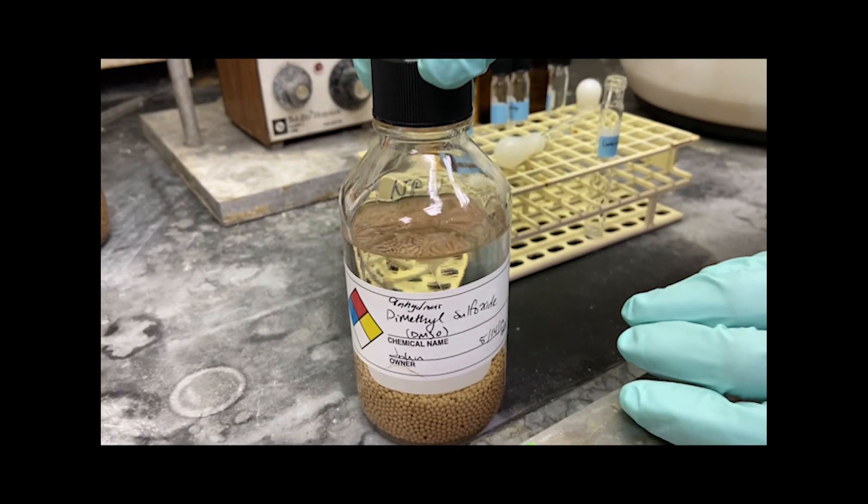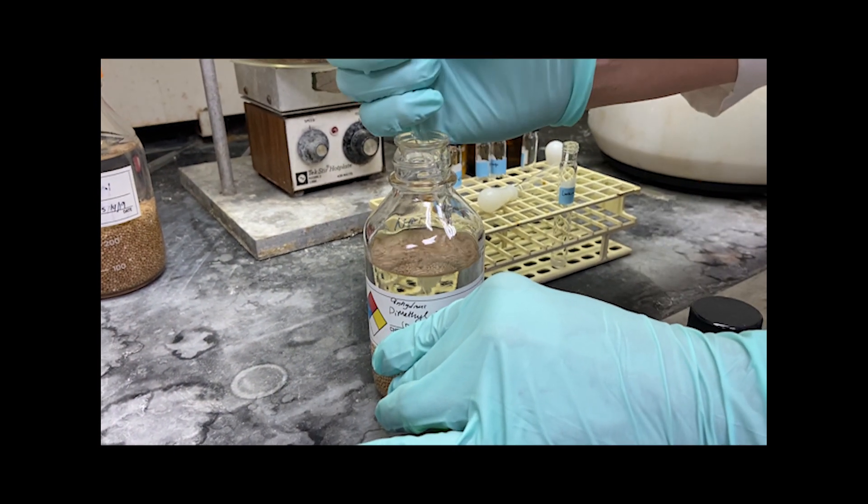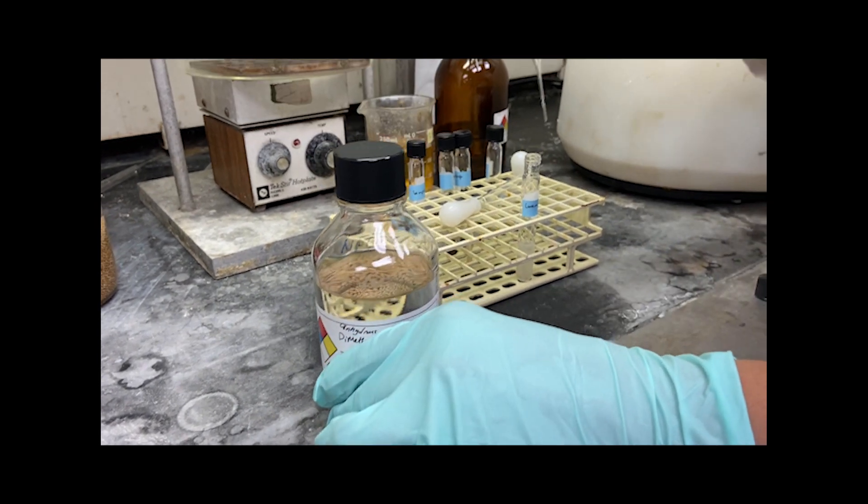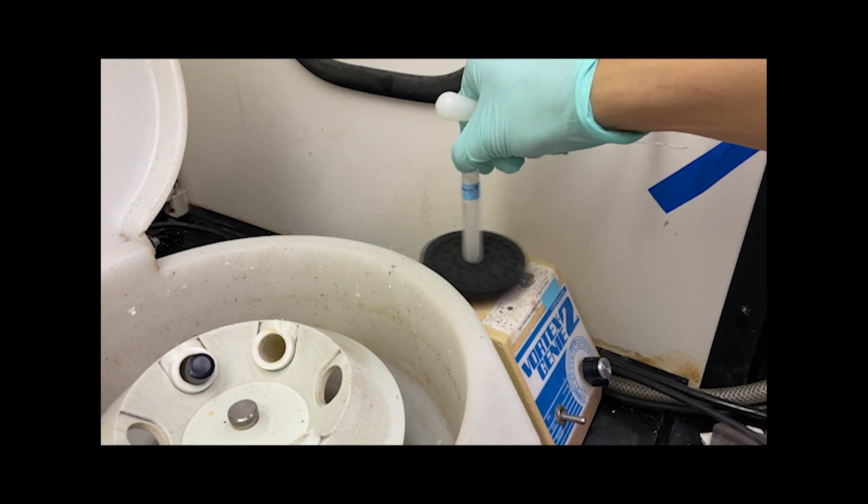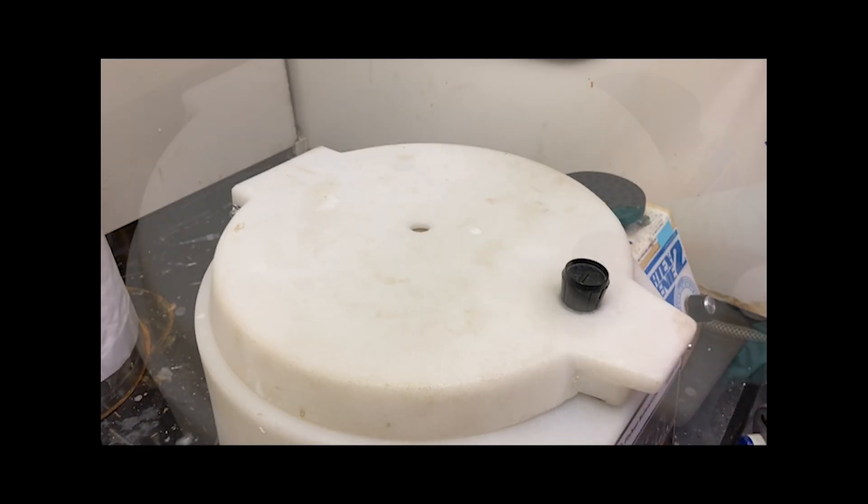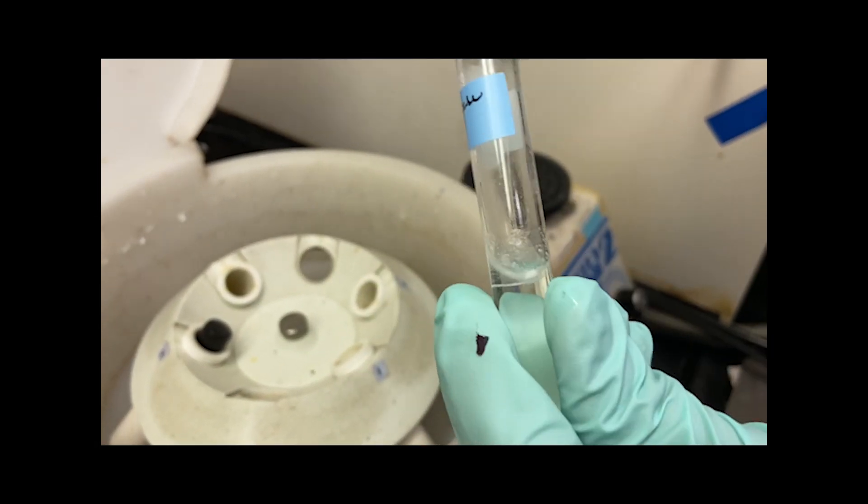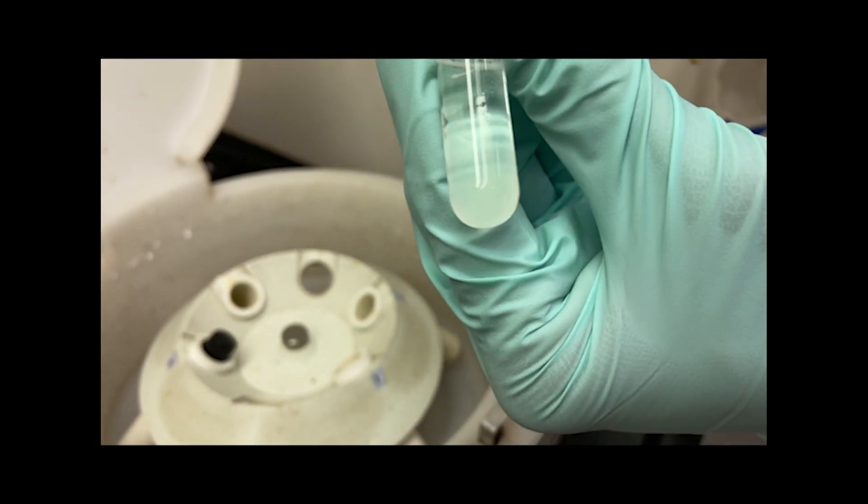Next, we add 2 milliliters of DMSO, vortex for 5 seconds, and centrifuge for 30 seconds to pellet the base. Here we have the base pelleted at the bottom of the tube. It is more opaque than the DMSO top layer.